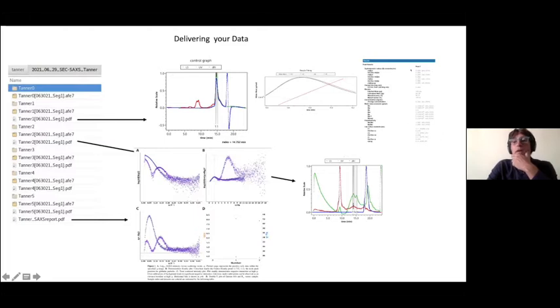That PDF file also has some values for you: what is the molecular weight of your main peak or additional peaks as well, like in this case. Some users ask me, oh, you have only 2 samples' information for SAXS, but you sent 7 samples. You still have 7 PDF files for the MALS.